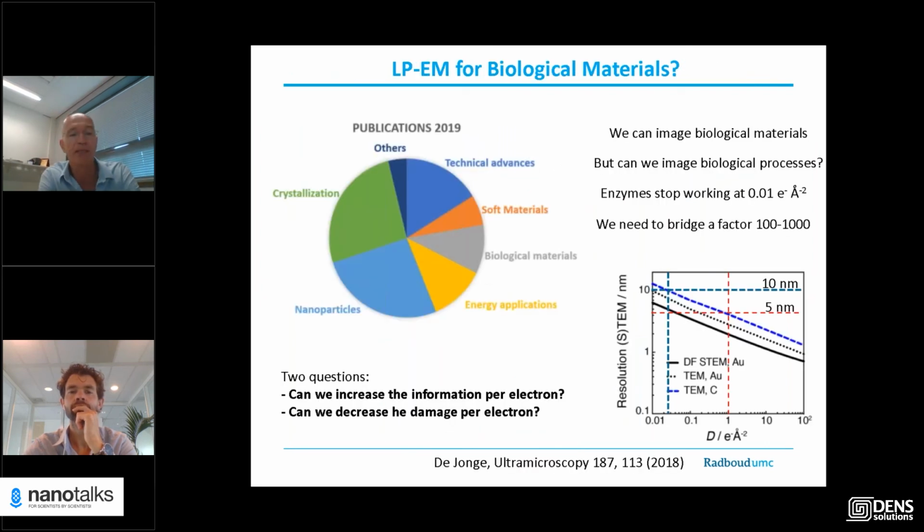Yeah, so it goes two ways. If we have some mild damage in the liquid phase, for example by creating positively and negatively charged particles or charged fragments of a molecule, they can recombine if we give the system enough time.